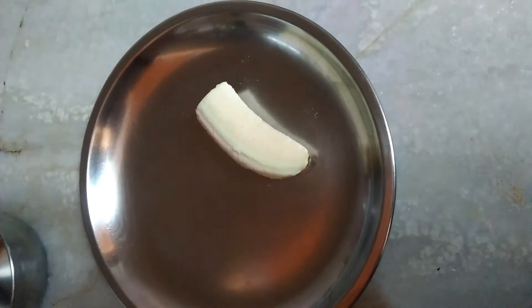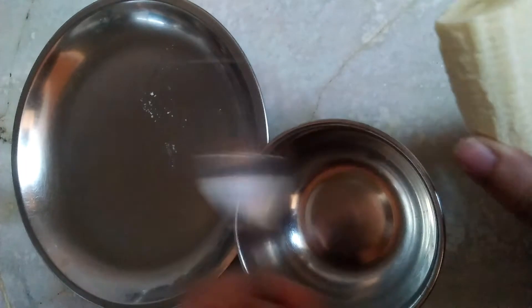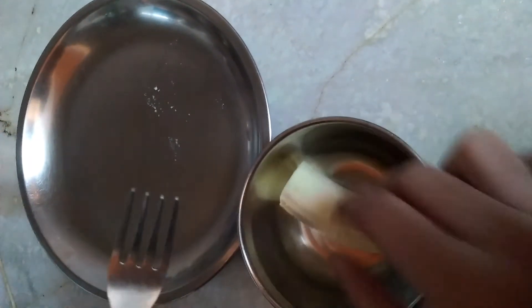First, put the sanitizer in the refrigerator and let it cool, as we'll be needing it later on.